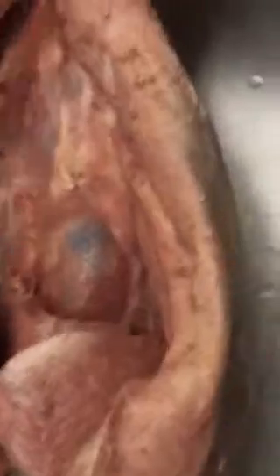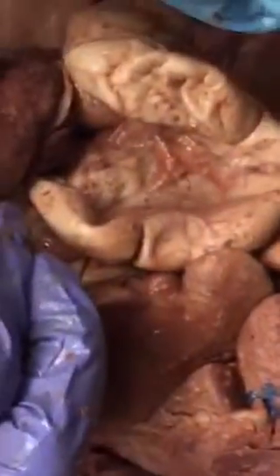Okay. So they're little round structures on either side of the abdominal cavity. So I'm going to go ahead and try and open up this one. Is it more to the right of the body? You have one on the right and one on the left.